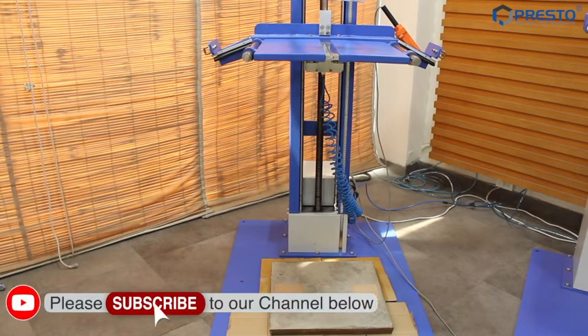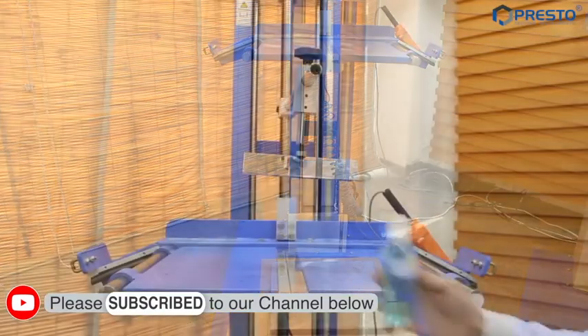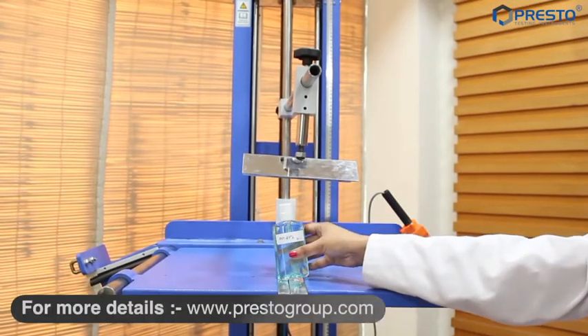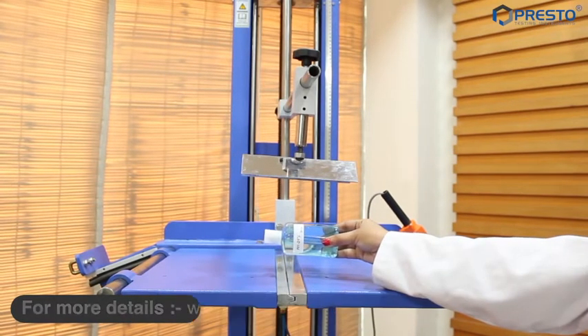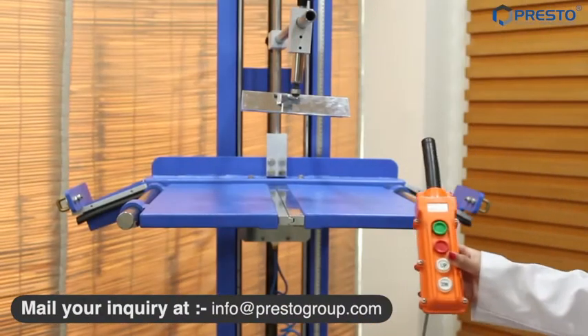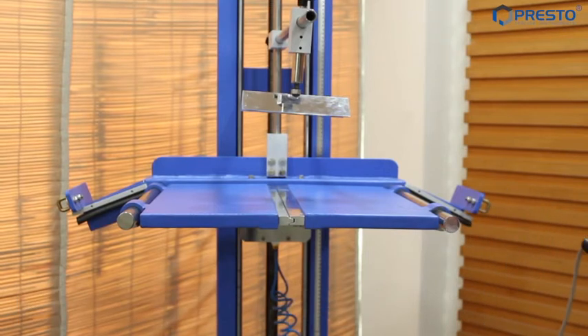As per testing procedure, one bottle has to drop two times from a dropping height of 1.2 meter — one in a vertical position by keeping the base of the bottle onto a rigid horizontal dropping platform, and second by keeping the axis of the body of the bottle parallel to the same platform. Now with the help of a remote switch, I am taking the dropping platform to a height of 1.2 meter.